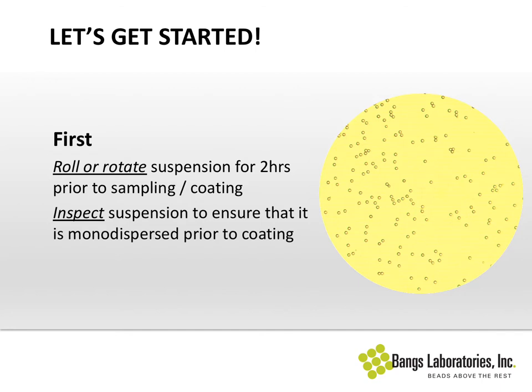Now that we've lectured you on proper care of your reagents, before we get started with the coating procedure, it's very important that you know you have a good quality suspension going into the coating. Because if you have an aggregated suspension, things certainly aren't going to improve once you begin the coating process. As a matter of course, we roll or rotate our suspensions for a couple of hours prior to sampling from a bulk container and certainly prior to coating, then inspect the suspension to ensure that it's monodispersed.